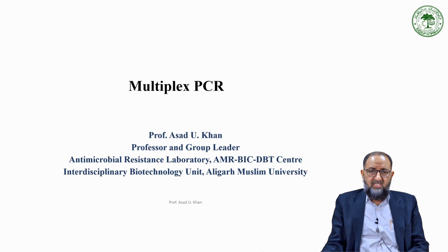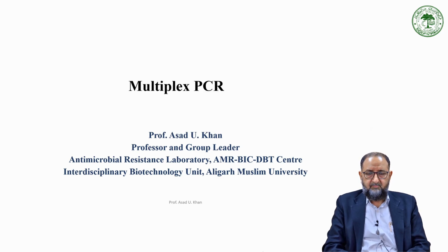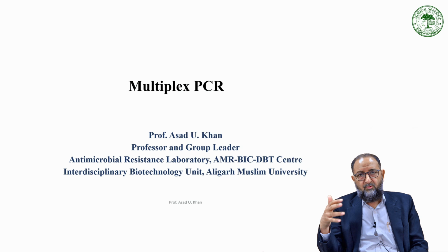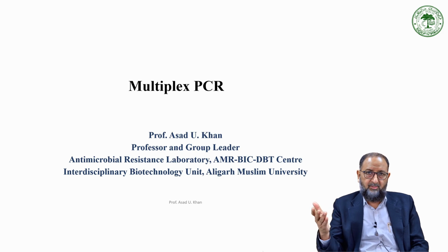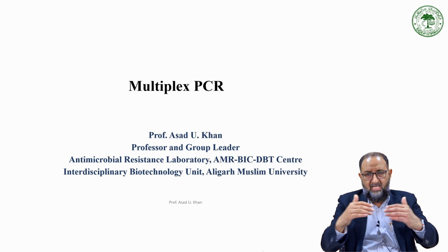Okay, so in this lecture, we'll talk about multiplex PCR. Multiplex PCR is the PCR where we use a larger number of primers to detect a large number of genes in the genome of a cell, microorganism, or pathogen. The advantage is that when we have many primers, maybe more than 2, 3, 4, 5 primers, you can have them all at a time.